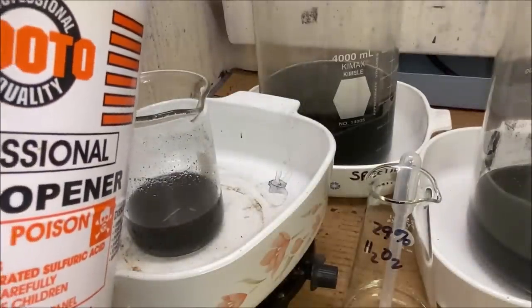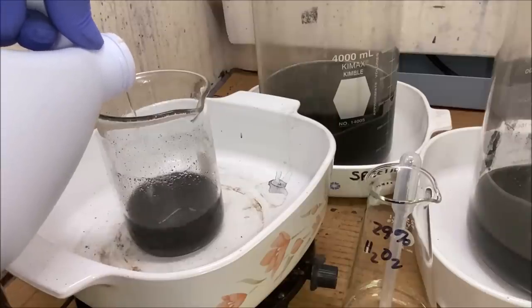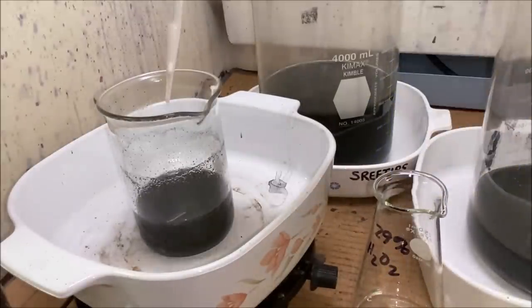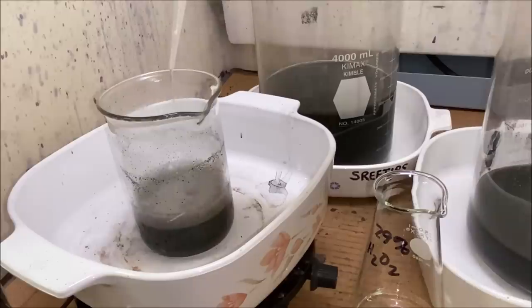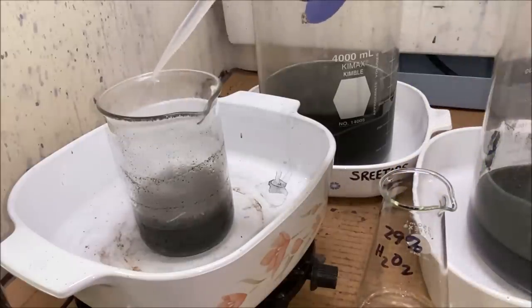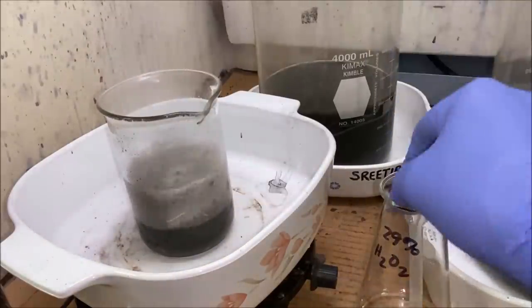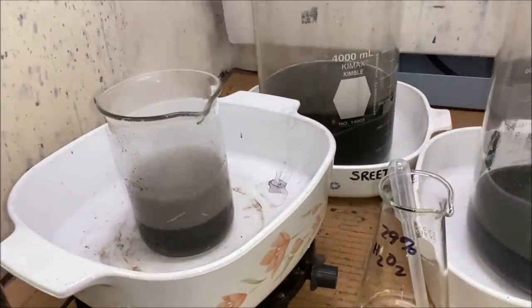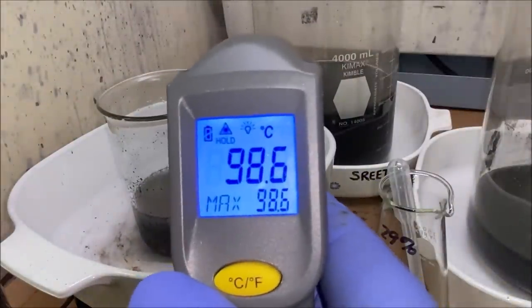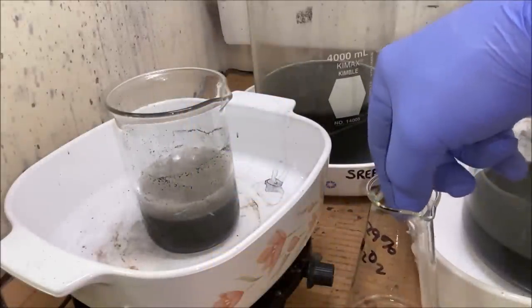I'm going to add a little bit more of the sulfuric acid. Let's try a little bit more hydrogen peroxide. Fresh acid livened it up. We're at 98 degrees Celsius, 209 Fahrenheit. And we know we ain't gonna put no metal in solution with this.